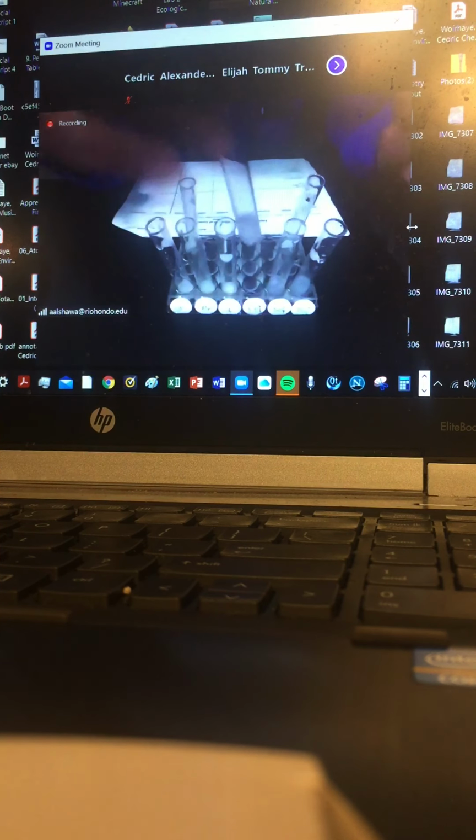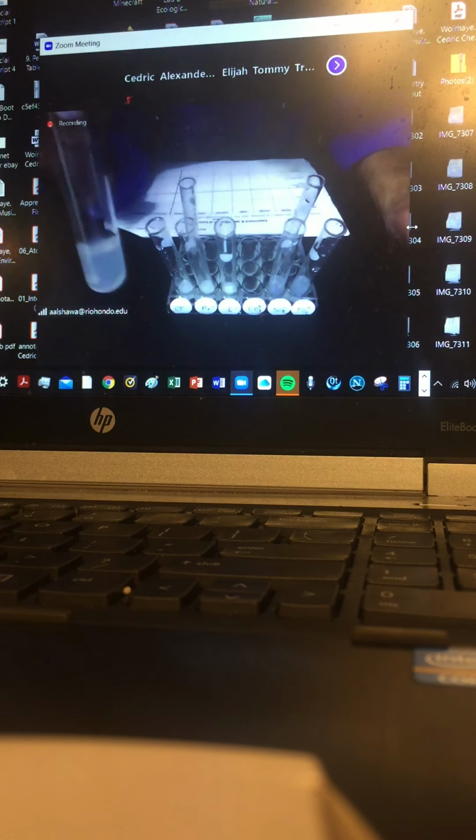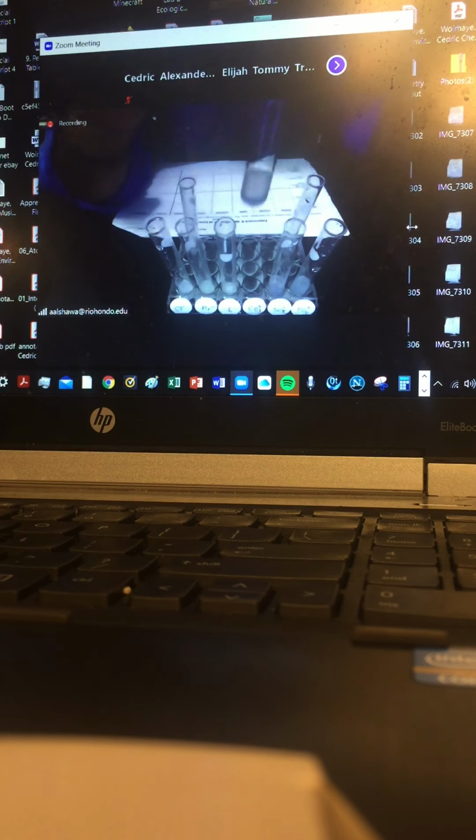So in here, let me just shake it. Okay. So remember, it used to be a solid. The carbonate formed silver carbonate solid precipitate, and doesn't seem to hold. So upon addition of 0.5 molar, it has to be 6 molar, 6 times the strength of that solution. I run out. I don't have 6 molar. But look what happened. So the solid is gone.